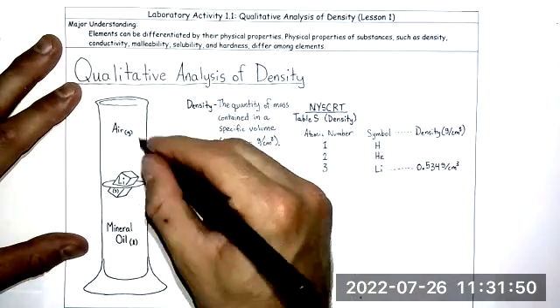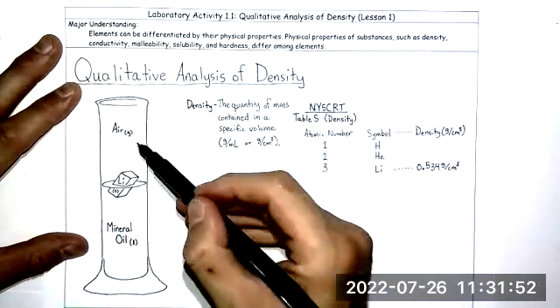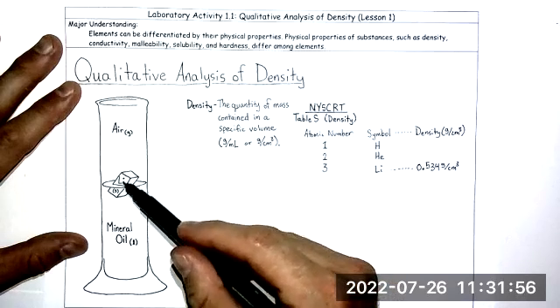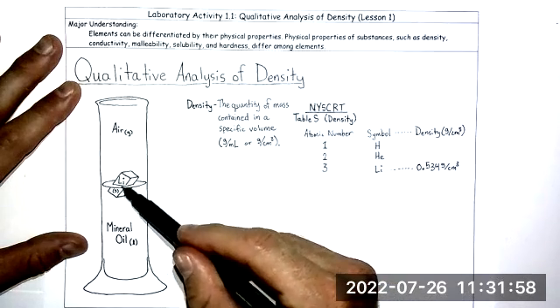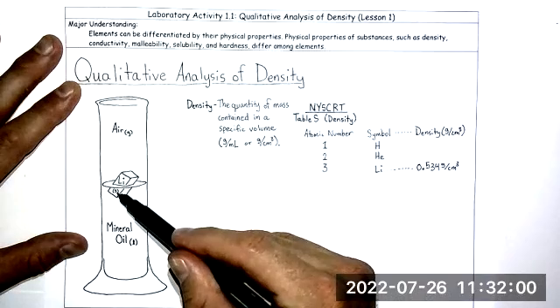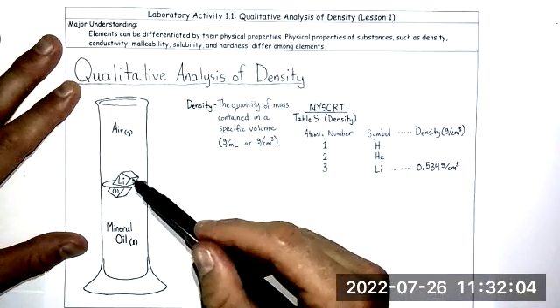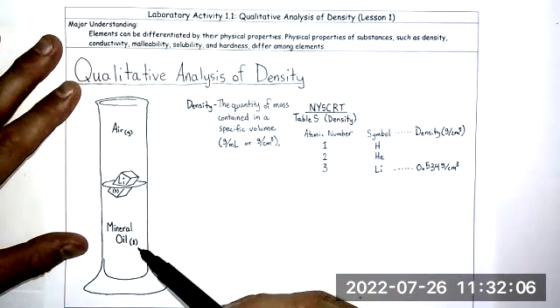Now, in our graduated cylinder, we have 3 pure substances. We have solid lithium. The parentheses S is telling us that our lithium is in the solid state. Then we have mineral oil, which is liquid. That's what the parentheses cursive L means.